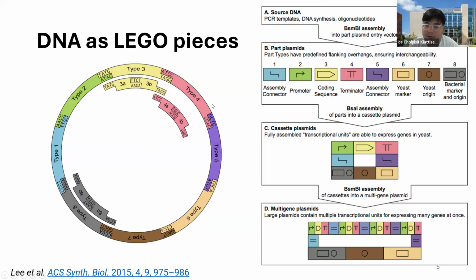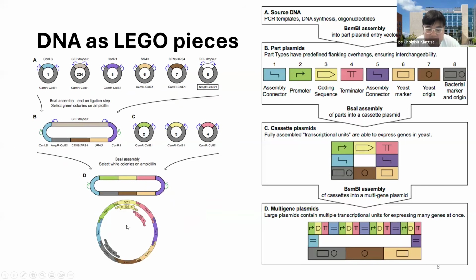The figure that you've seen right here shows at least 8 parts that were combined together, where these parts have different functions. Just to not get into too much detail, these parts were made from a lot of pre-made systems that were available here. Then you combine them into one particular setup.